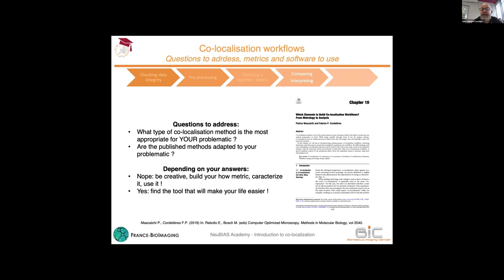Well, if the methods that have been published work on your specific problematic, and if this is okay, then fine. Just go and find the tool that is the most appropriate for your workflow, especially if co-localization is only one part of the workflow. You've got to be able to chain all the steps so that you can automatize and remove the human bias in the analysis.